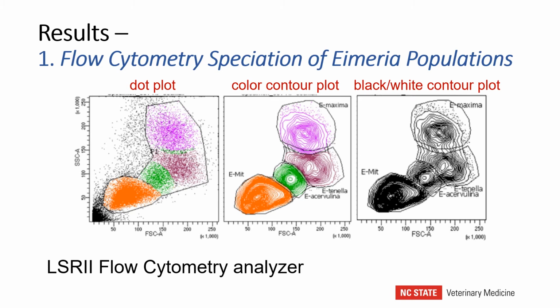The contour setting on the flow cytometer is a visual aid where the machine tries to predict the individual populations. The circles in the center of the contour lines represent the most certainty of a given population, similar to the contour lines of a topographic map, where the central circles represent the highest point of a given landscape.